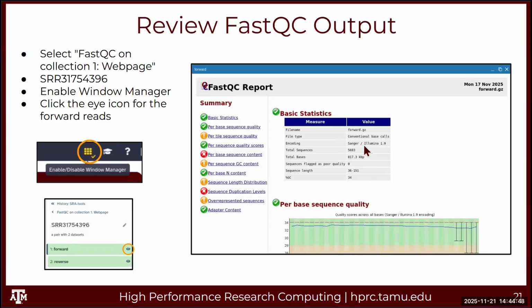So I'll just go ahead and look at this one here until that's finished. One thing about an older Galaxy version is that you had to convert files to FASTQ Sanger because there are two types of FASTQ files. The older sequencing platform was not in FASTQ Sanger, so you had to convert it to FASTQ Sanger. There's actually a tool that did that for you. You had to go and click and make the conversion.